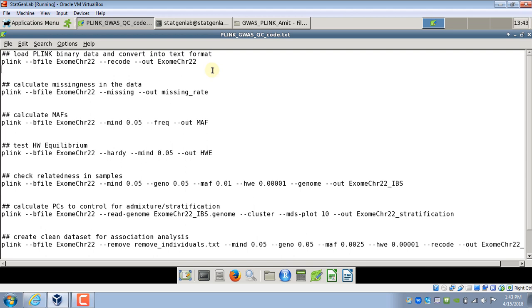And if we have particular SNPs or individuals with more than average missingness, then we might want to exclude them from our analysis or go back and check our dataset for any kind of formatting error because of which we got missingness. So to do that, we need to look at missingness in our data both by SNP as well as by individual.